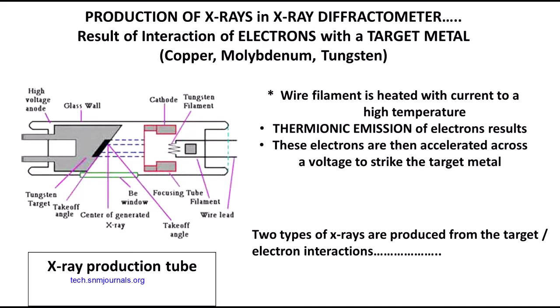Often, the X-ray source is a tube that contains the electron gun and the target material inside of a vacuum tube. The electron gun is heated by passing electrical current through the filament, and when the filament is sufficiently hot, then the electrons in the filament can overcome the work function of the material and escape from the material surface.